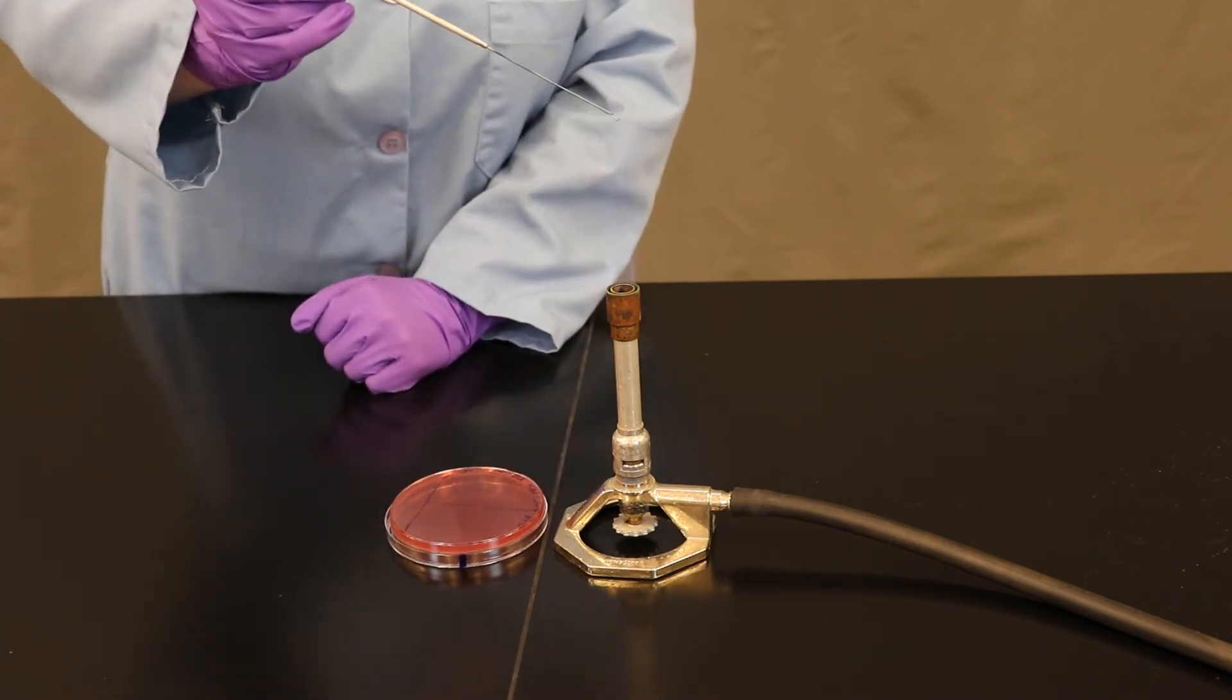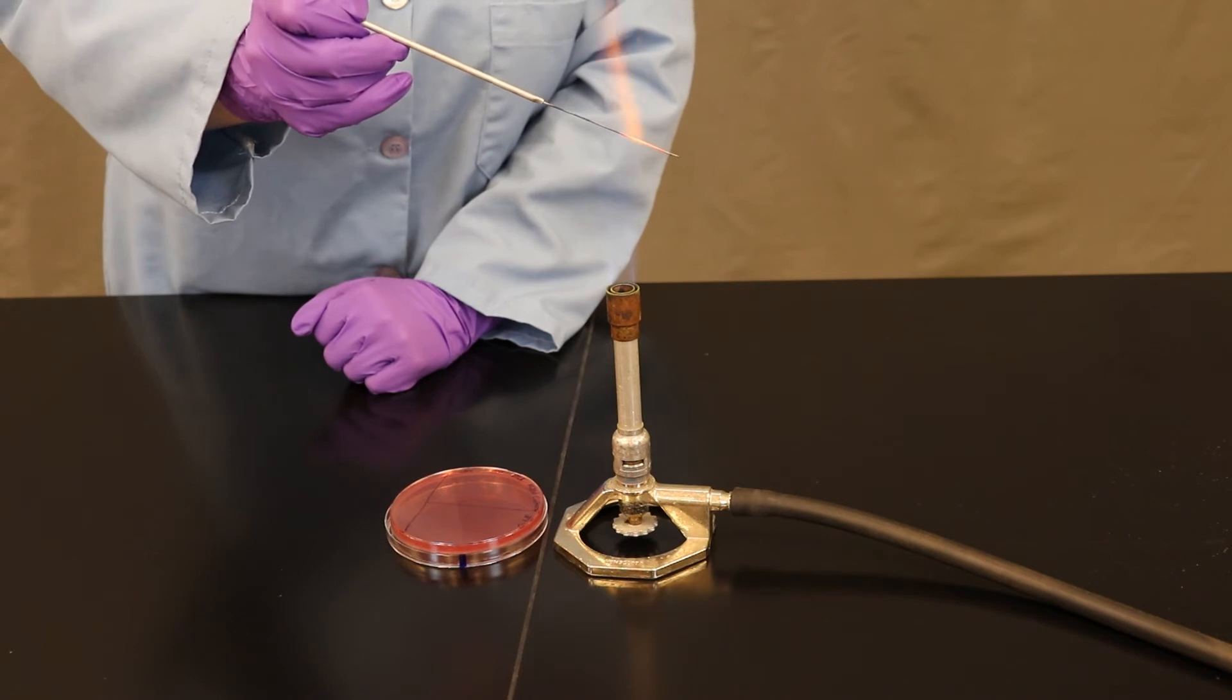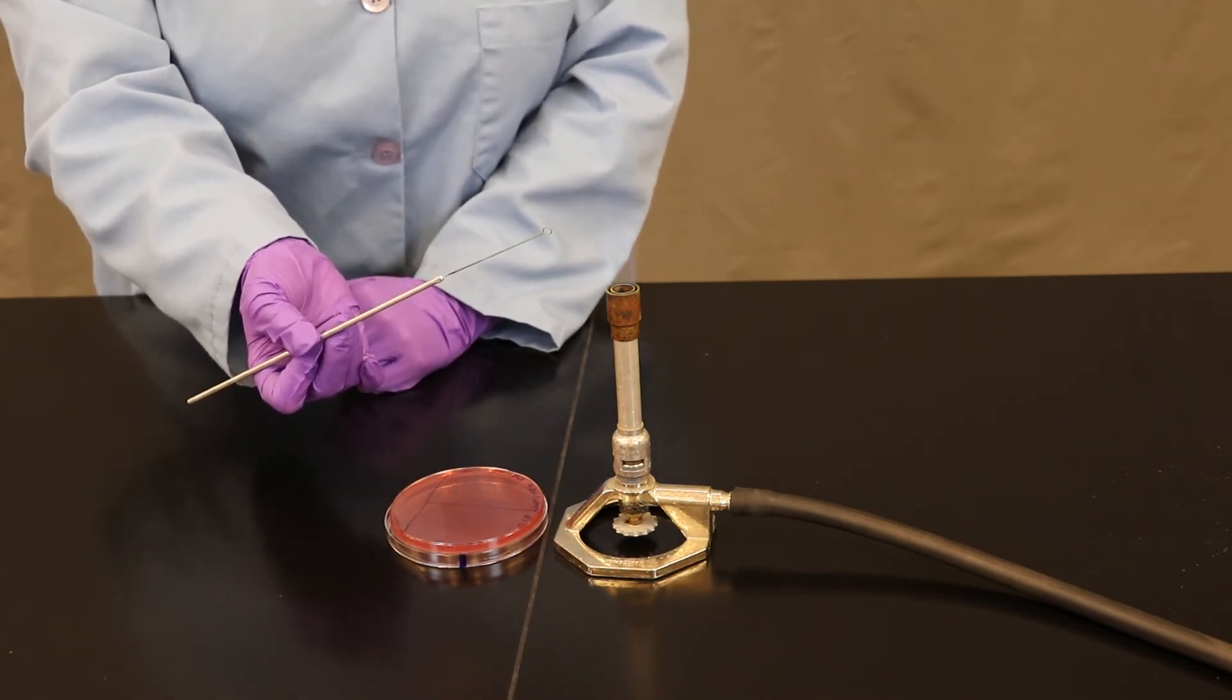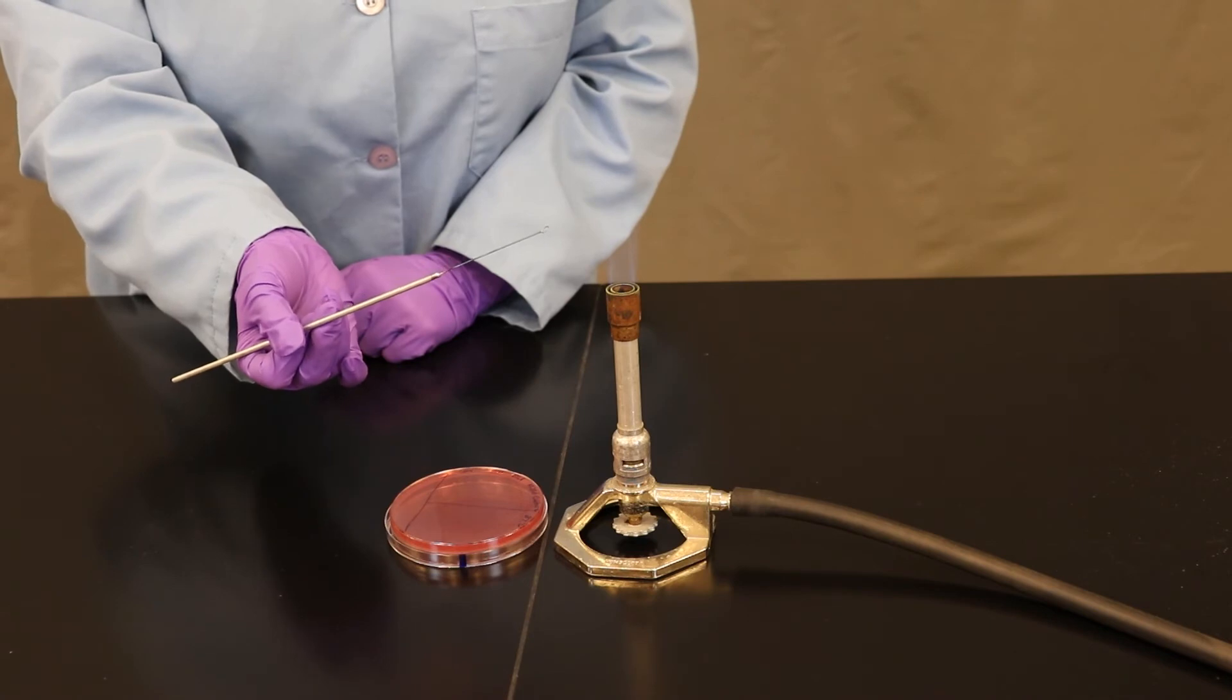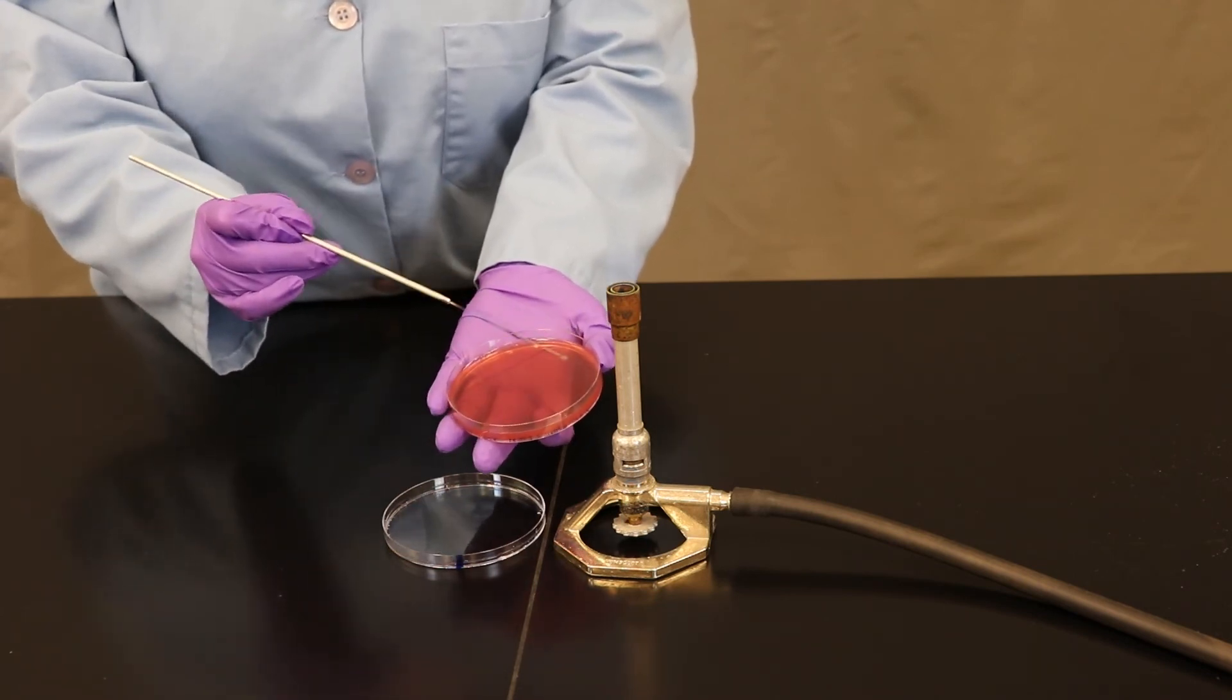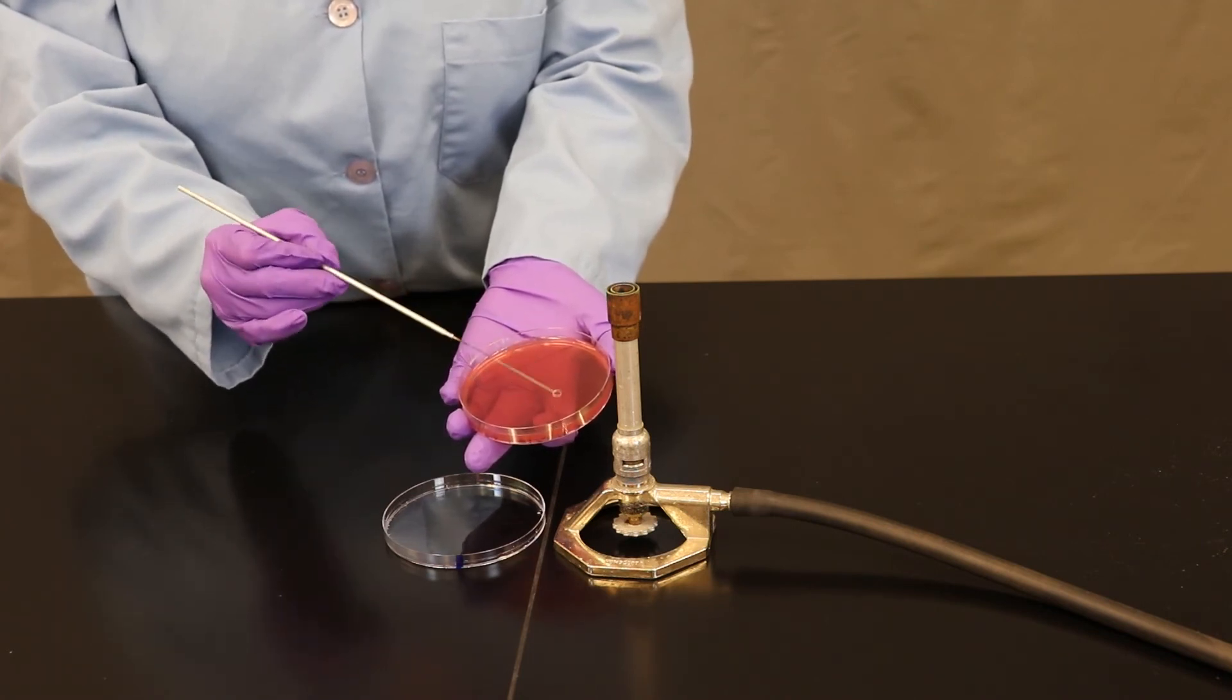Place it on the lid, and one more time we're going to sterilize our inoculating loop. Allow it to cool. Remember, we're not double dipping back into our broth. And now it's really important I'm not going back into this first zone. Now I'm going to grab the bacteria from zone number two, and I'm going to streak it into this last zone that's now empty. Touch it down onto the agar to cool the loop if you wish.